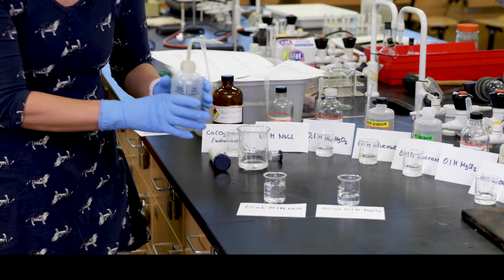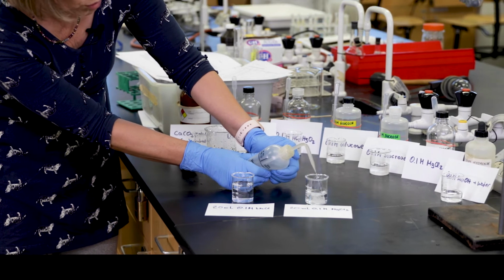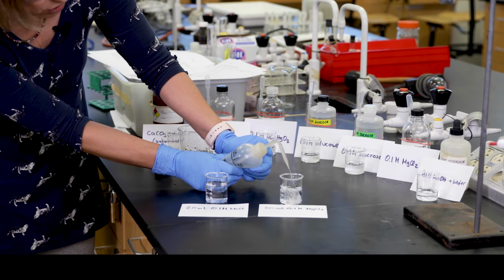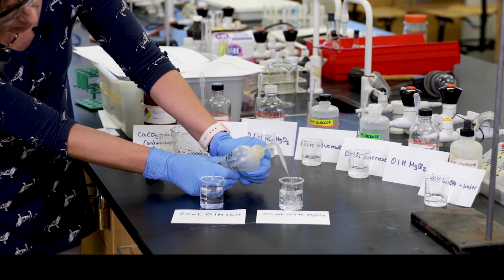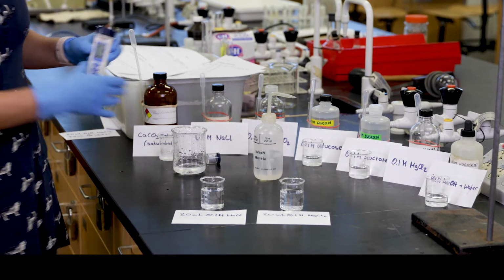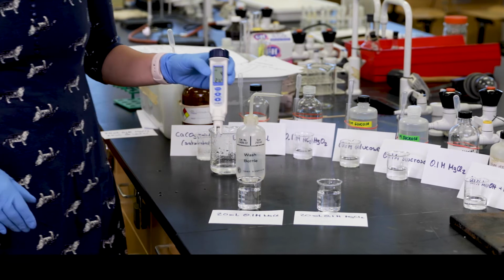I use DI water. DI stands for deionized water. So in this water there are no ions. The ions are removed by ion exchange. So let's see what happens with the conductivity once I diluted those solutions.